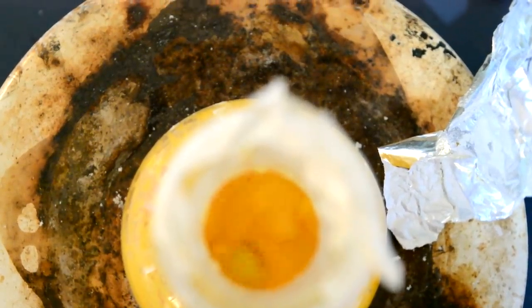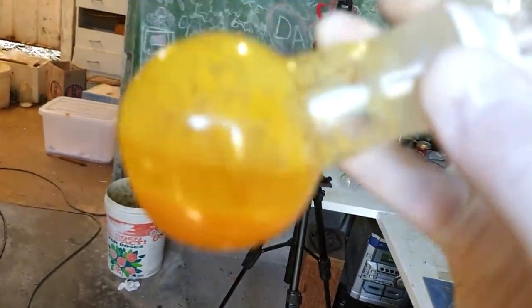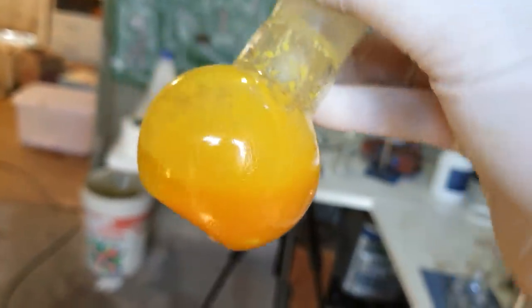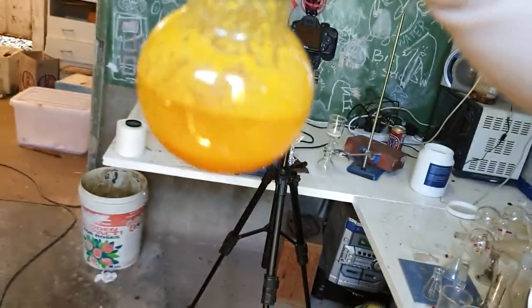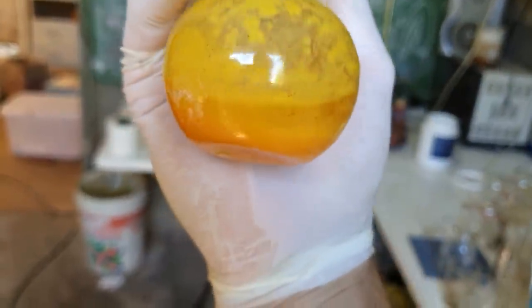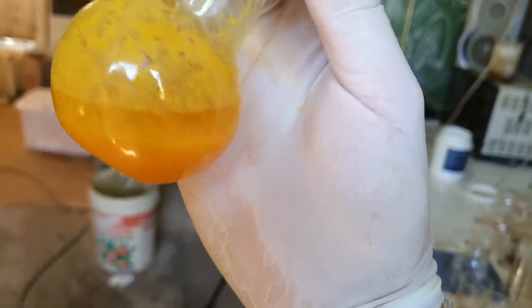So it actually hasn't crystallized out. I was really optimistic, but you see that water there, but then below the water, there's this horrible orange liquid layer, and that's our product. So we've got a lot of product, but if I try to filter this now, I'm worried that all our product will just go straight through the filter, because it's not really a nice solid.